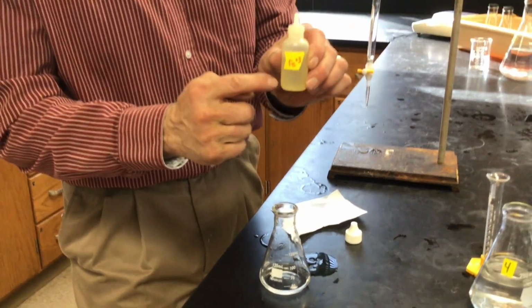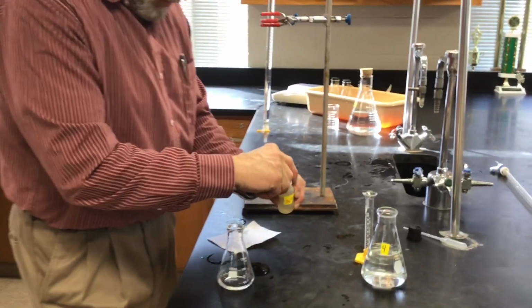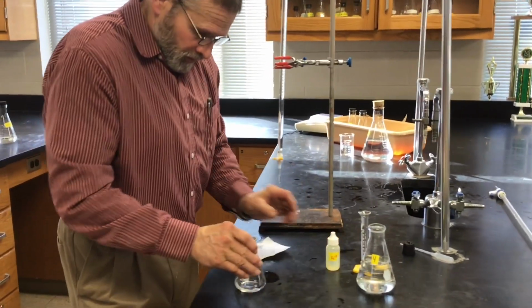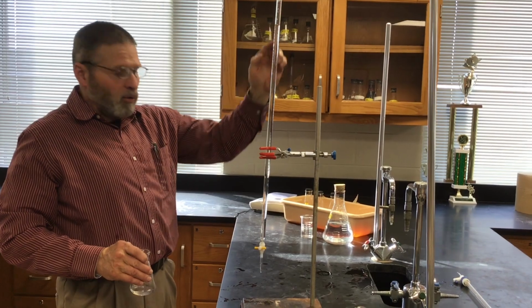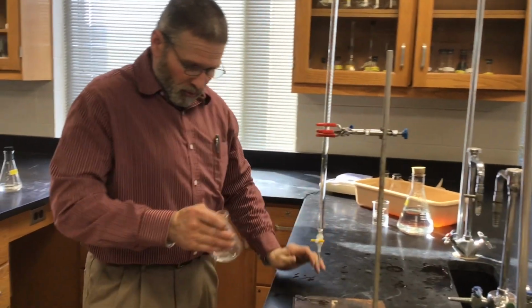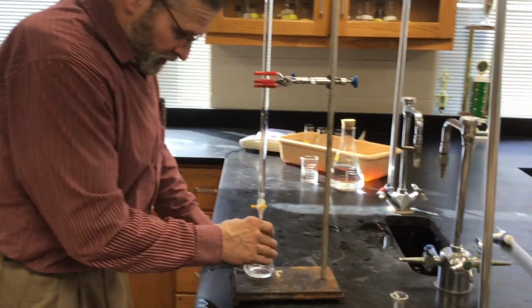This is the Fe plus 3 indicator. We got the burette full, so we're right at the 0.0 mark.